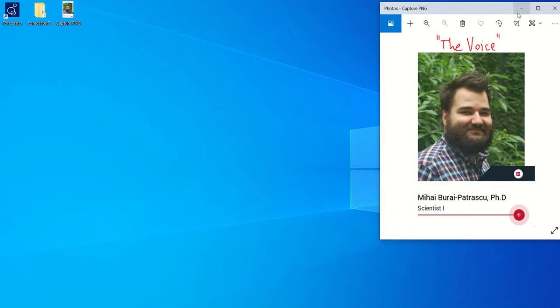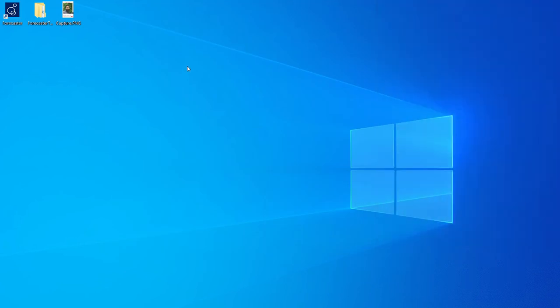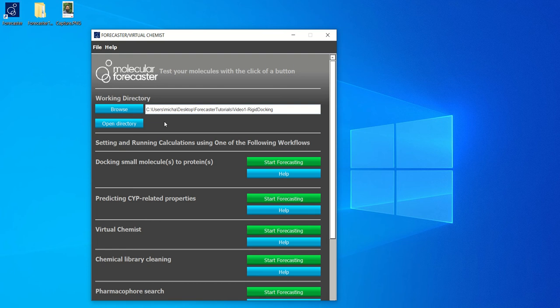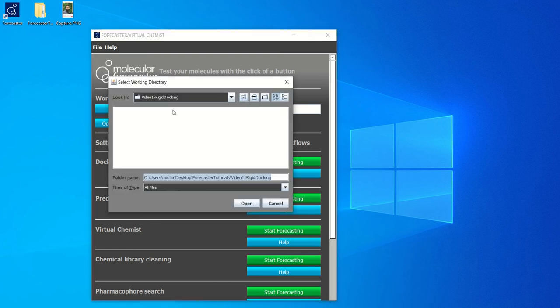After you have downloaded and installed Forecaster, you will see a shortcut on your desktop for the graphics user interface. So let's go ahead and open it. And once you've opened it, you can set your working directory by clicking on browse. Since we're at the first video, we will set our working directory to video 1 rigid docking.